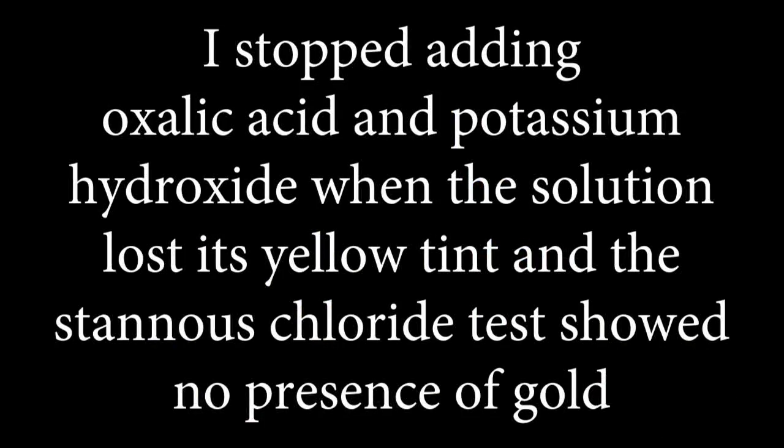I stopped adding oxalic acid and potassium hydroxide when the solution lost its yellow tint and the stannous chloride test showed no presence of gold.